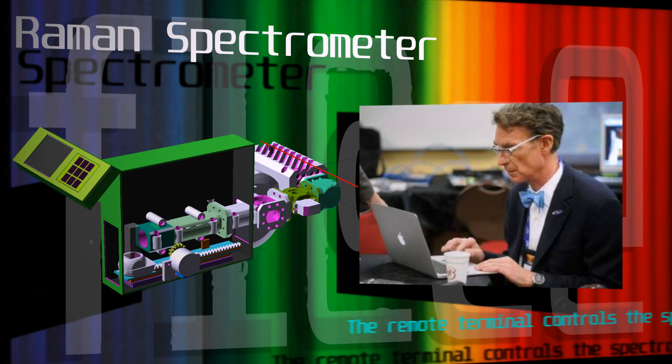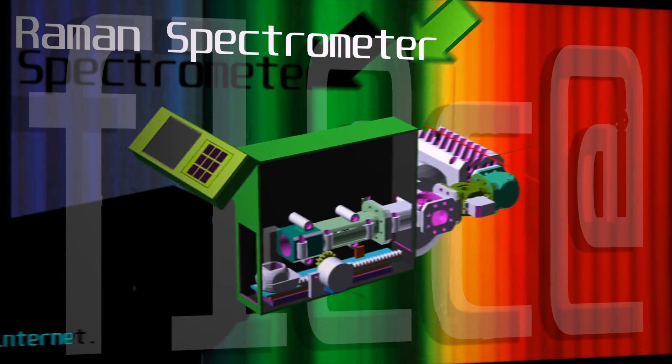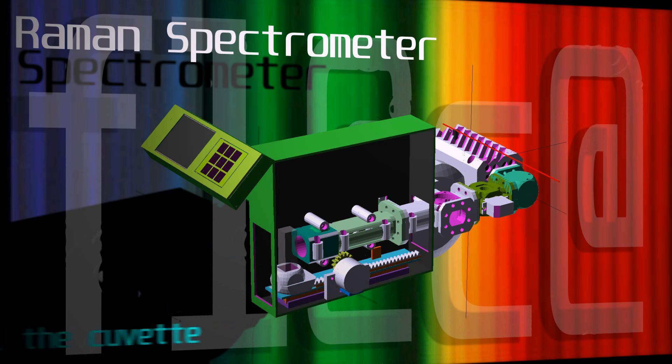The spectrometer is controlled through a remote terminal where it is instructed to perform an analysis. The spectrometer then powers up the laser, selects the first edge filter, and then continues by balancing the temperature of the cuvette.